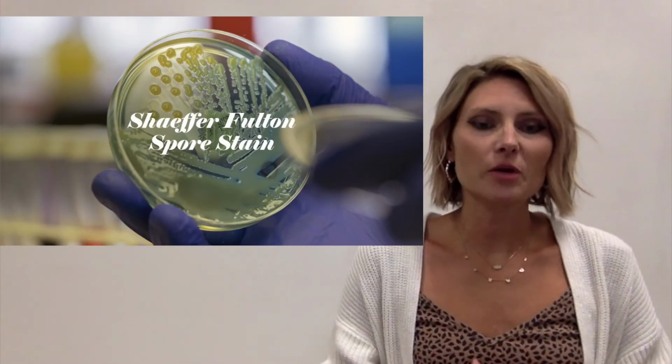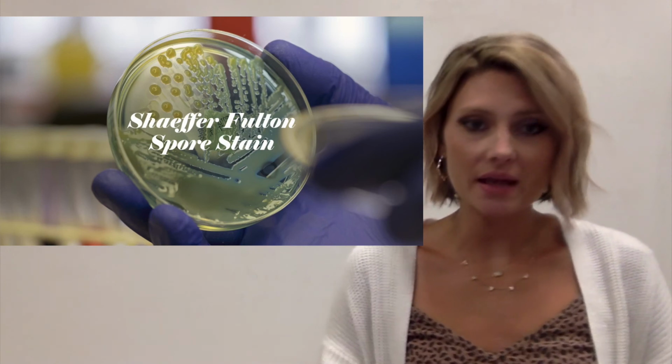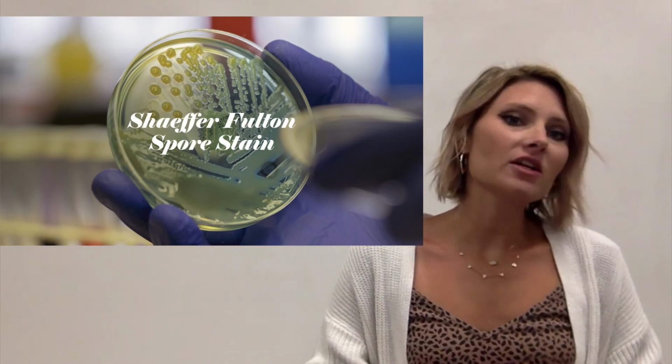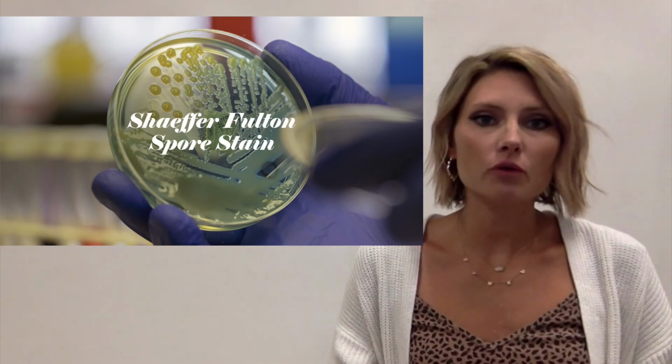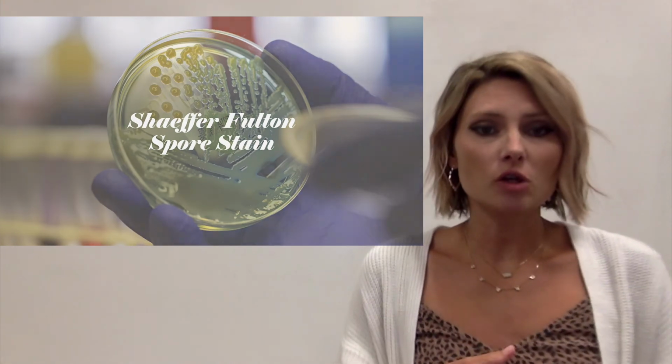Hi class, we are back in the lab today and we are going to be doing the spore stain. Before I actually demonstrate this for you, I'm going to go over a little bit about spore formers, the spore cycle, and then talk a little bit about the stain before we actually perform it.